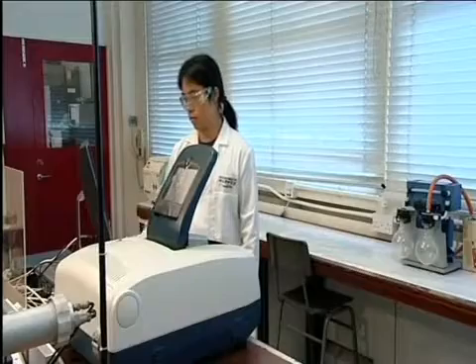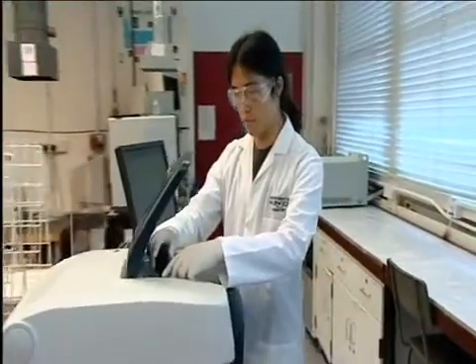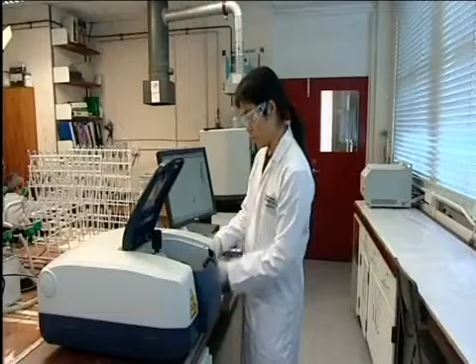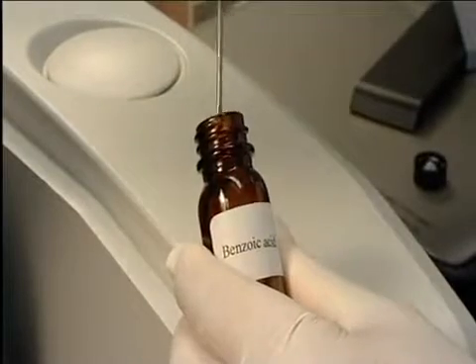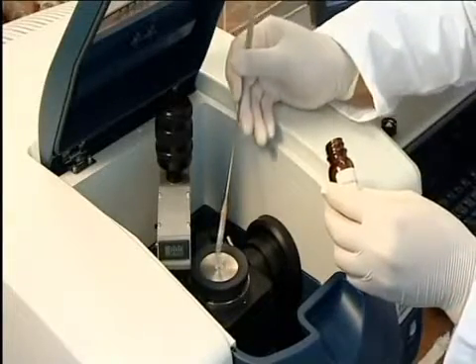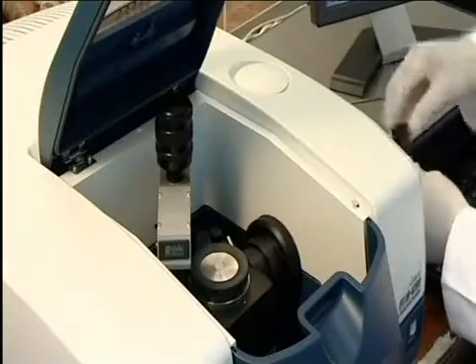Here we will run the IR spectrum of solid benzoic acid. The instrument is switched on and a blank is run with no sample in place. This is to find the absorption of the air, which must be subtracted from that of the sample. A little benzoic acid is placed on the ATR crystal. This is a holder for solid samples. Less than 1 milligram of solid sample is required.